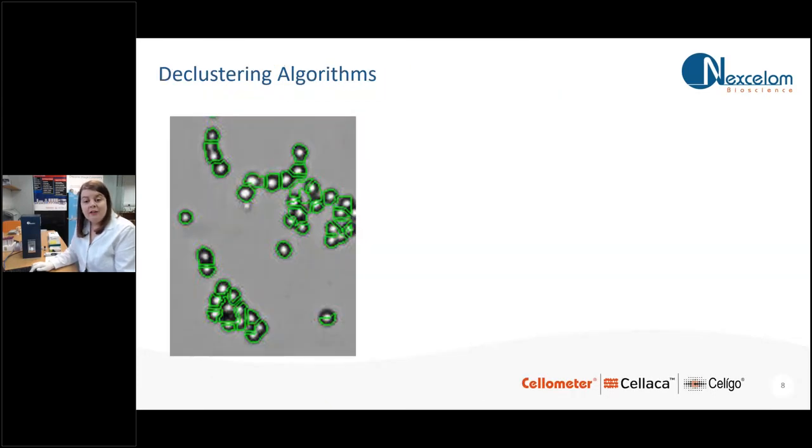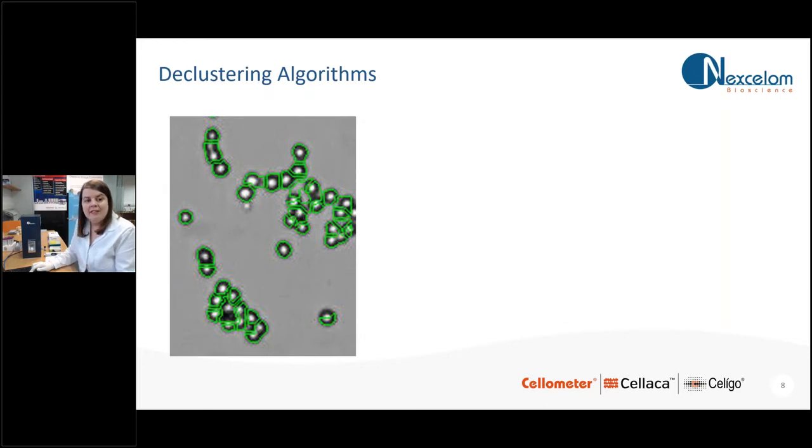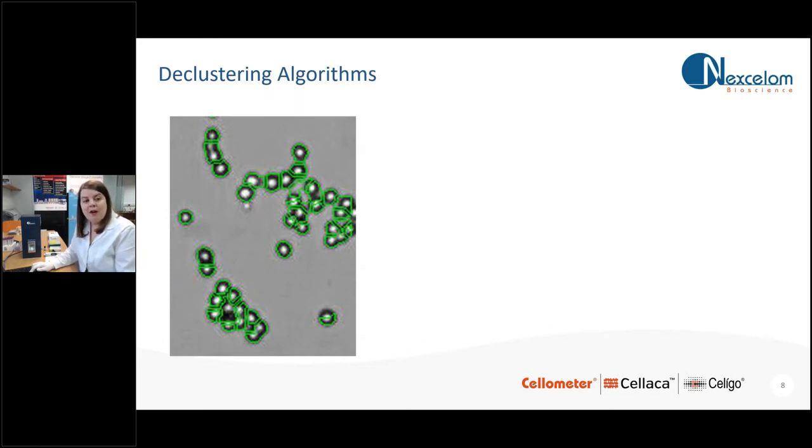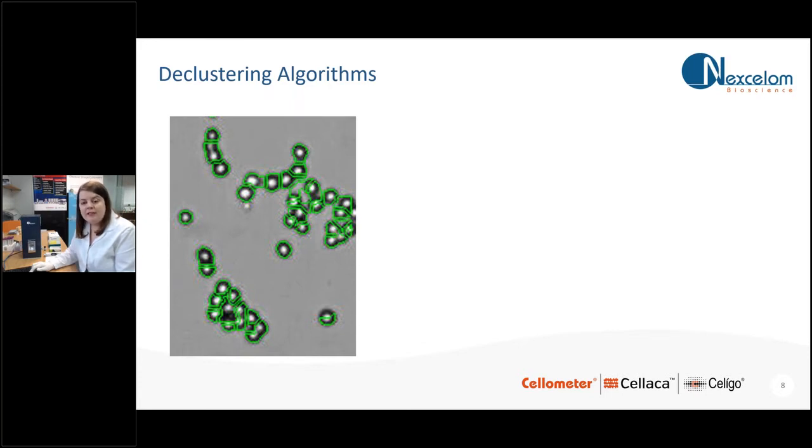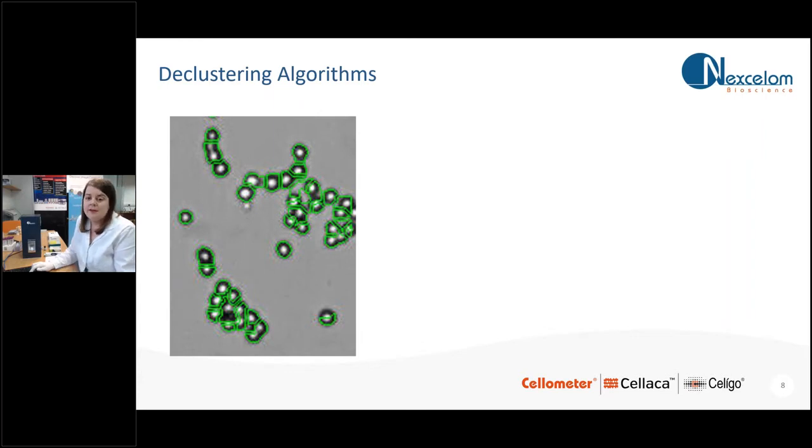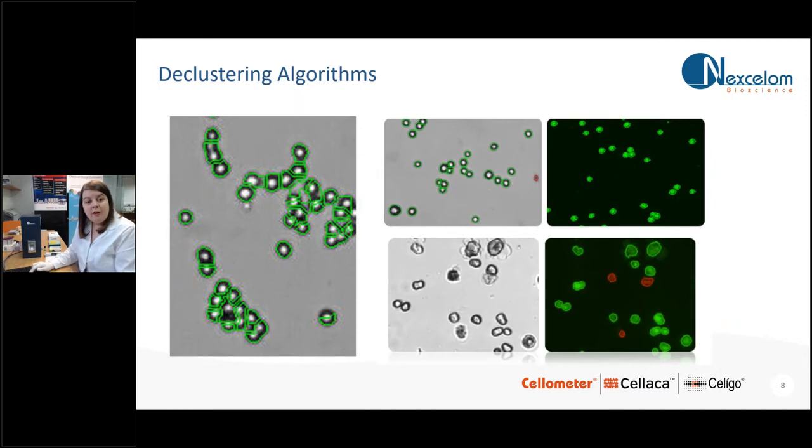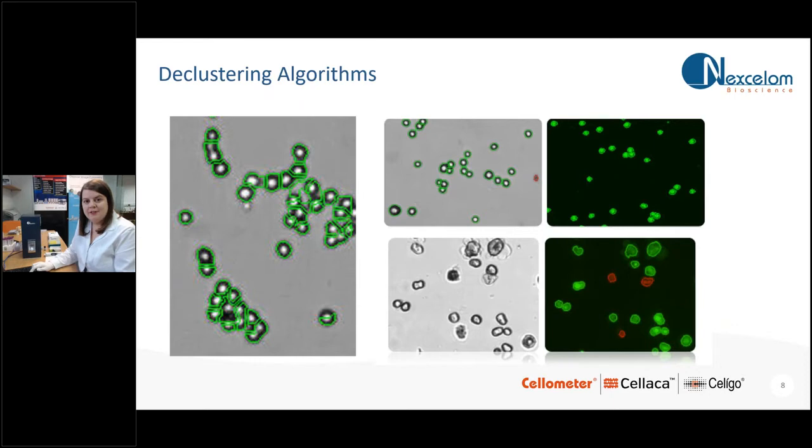And that accurate membrane outline algorithm means you will also get accurate declustering as well. So instead of estimating how many cells there are in a clump, the Cellometer software will actually look at that membrane outline algorithm and accurately detect the number of cells within your chains and within your clumps of cells. And using the bright field imaging in combination with a fluorescent nuclear stain makes it even easier to do declustering.